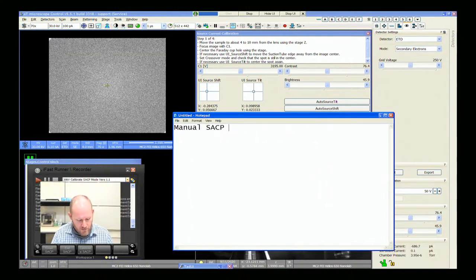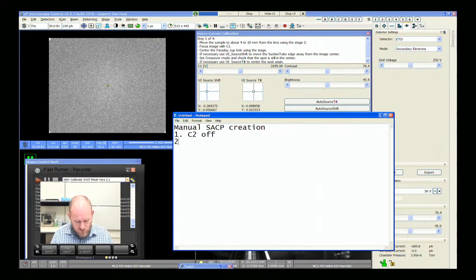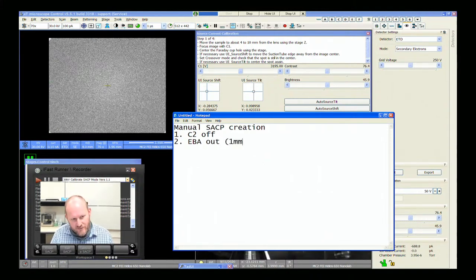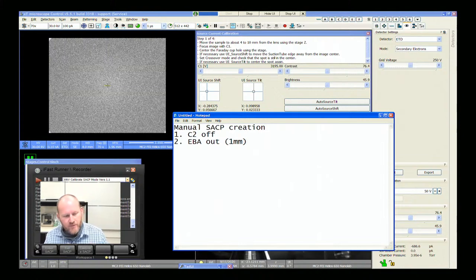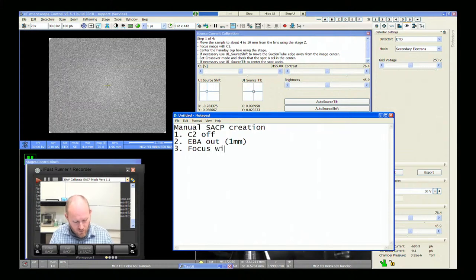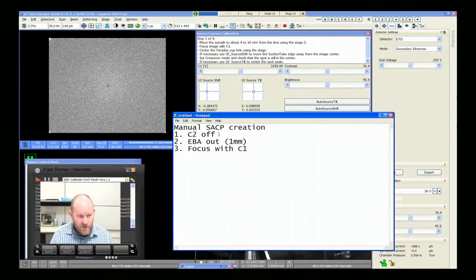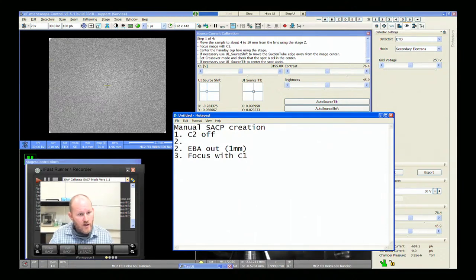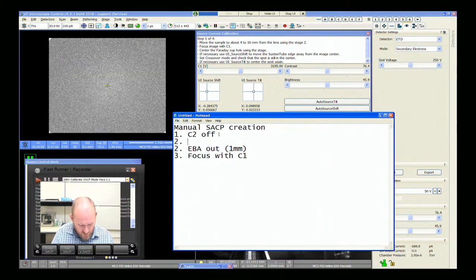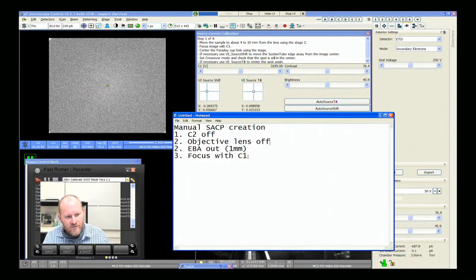So we're doing a manual SACP creation. First step is C2 off. Second, EBA — electron beam apertures out; it effectively is a one millimeter aperture, so the aperture doesn't affect the beam at all. Third, objective lens off — because if your objective lens is on, you're not going to find an appropriate C1 value. Fourth, focus with C1. The UC source current alignment conveniently does steps one, two, and three all at once.